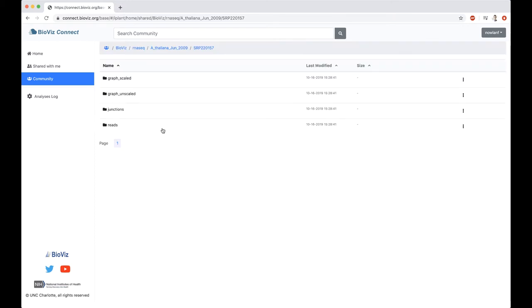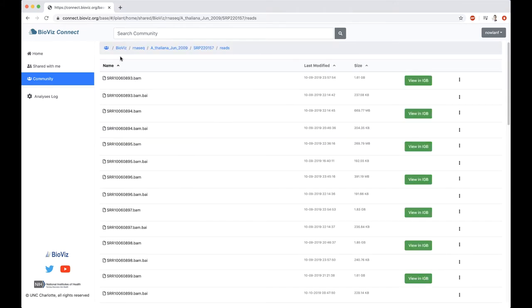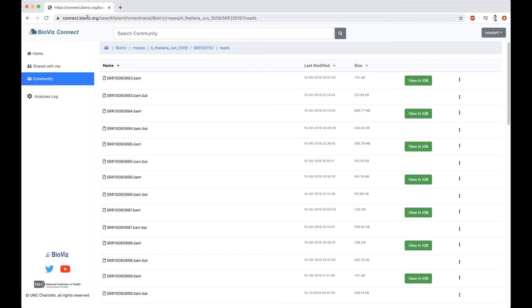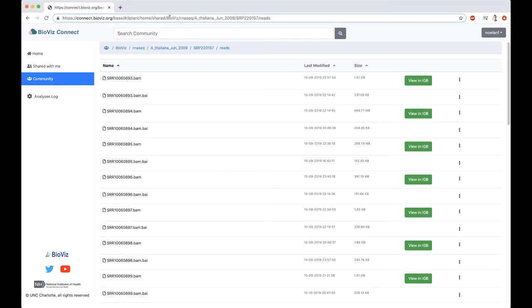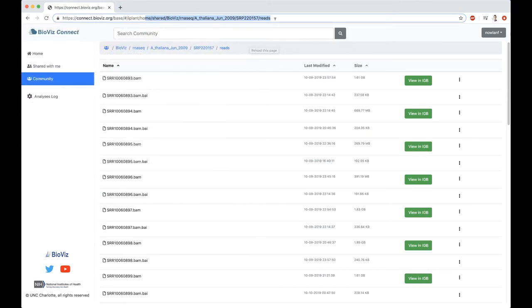We want to look at the reads. There are a couple of things to point out while we're here. You can see we have this breadcrumb trail. You can see the current directory that you're in and where that's in relation to the rest of the folders. It also allows you to easily jump back to a previous folder if you need to. You can also see that up here in the URL, you have the same thing. Your browser buttons will also work, so you can jump back to previous pages or forward.